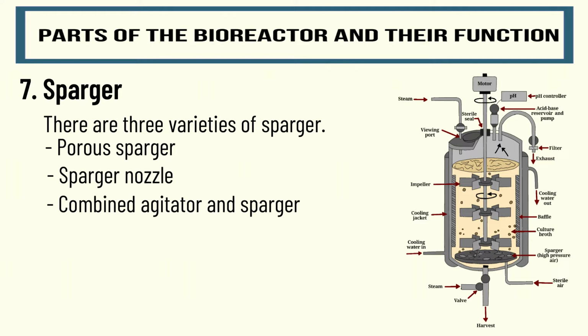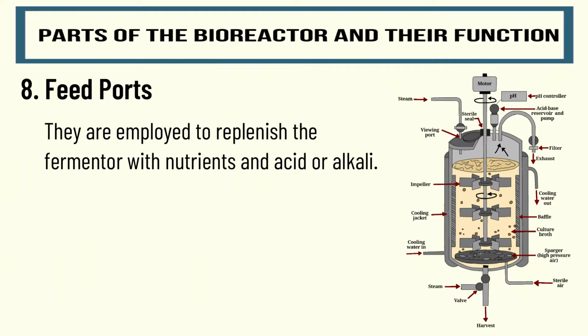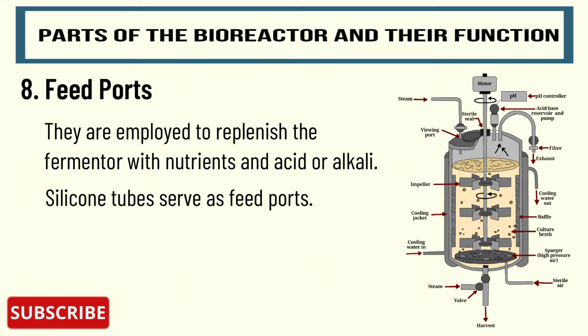Number 8. Feed ports. They are employed to replenish the fermentator with nutrients and acid or alkali. Silicone tubes serve as feed ports. The products are sterilized in place before being removed or added.